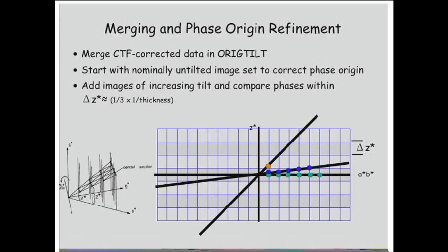But what you can do is assume that within a certain Z star limit, all measurements should be the same. So what we're going to do is bring together measurements that are locally within a certain value of Z star for each of the diffraction spots.